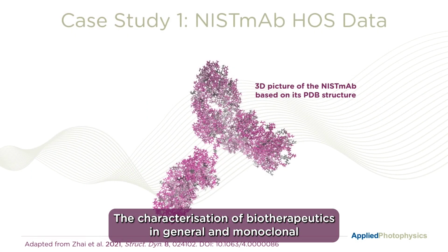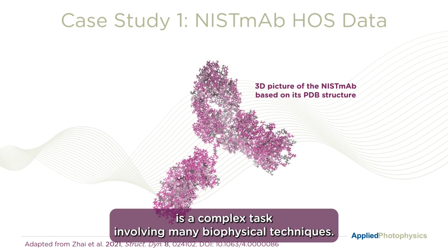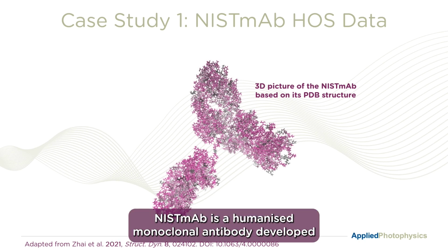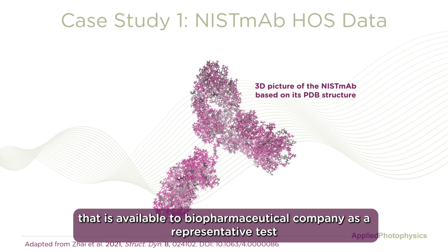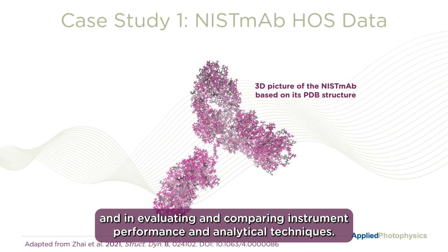The characterization of biotherapeutics in general, and monoclonal antibody therapeutics, or mAbs, in particular, is a complex task involving many biophysical techniques. NISTmAb is an excellent case study on the matter. NISTmAb is a humanized monoclonal antibody developed by the National Institute of Standards and Technology, NIST, that is available to biopharmaceutical companies as a representative test molecule to assist in method development and qualification and in evaluating and comparing instrument performance and analytical techniques.